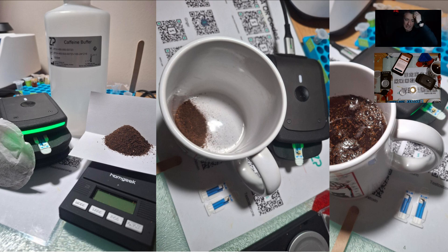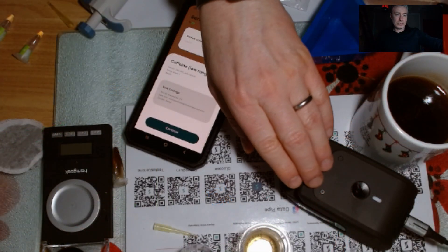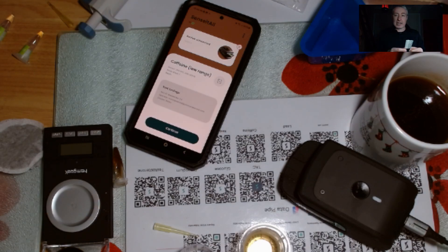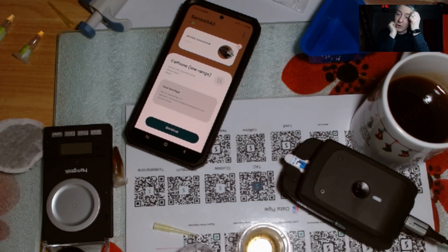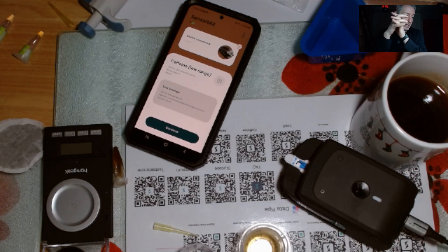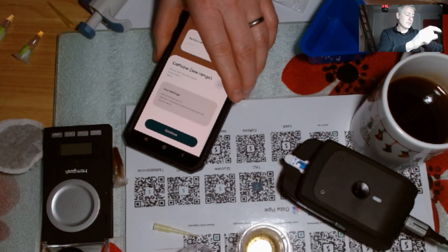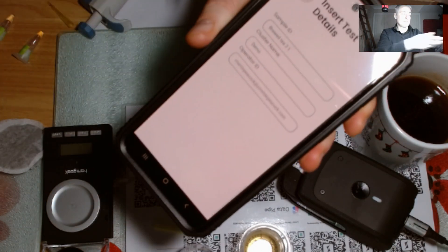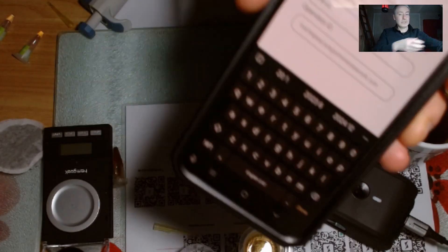Let me go to my camera. I've got the food sensor in front of me — it can measure caffeine. There are other videos where you'll see us measure caffeine per gram of tea leaf, or per gram of coffee, but this is different: we're measuring the caffeine actually in the beverage itself, after the tea leaves have been extracted in boiling water. I've got a sensor in here and I'm going to call the sample 'Brewed T T2' — these names just help me find the data later on.